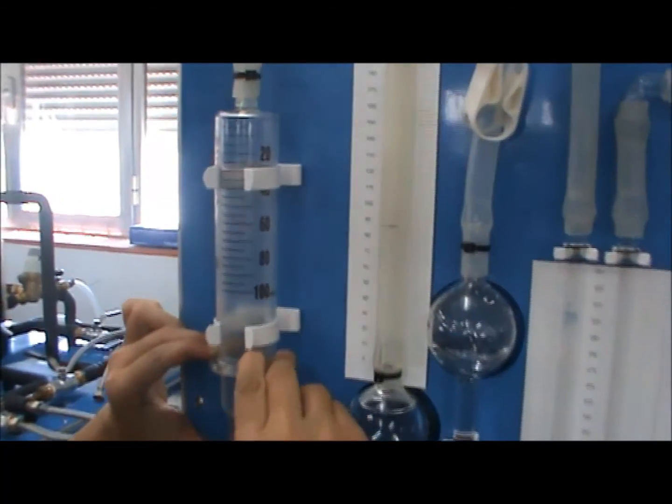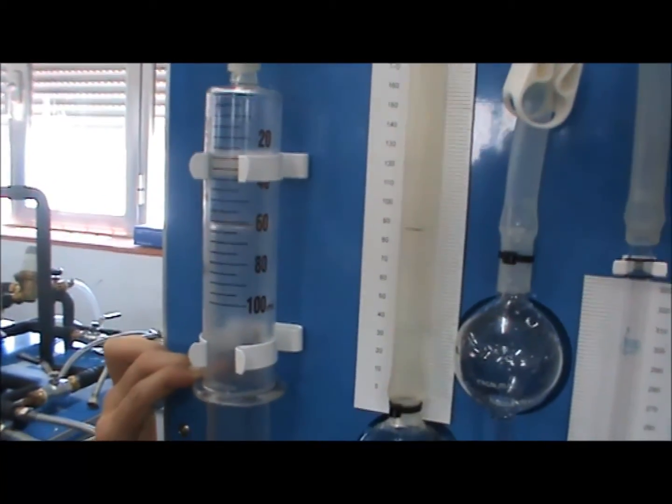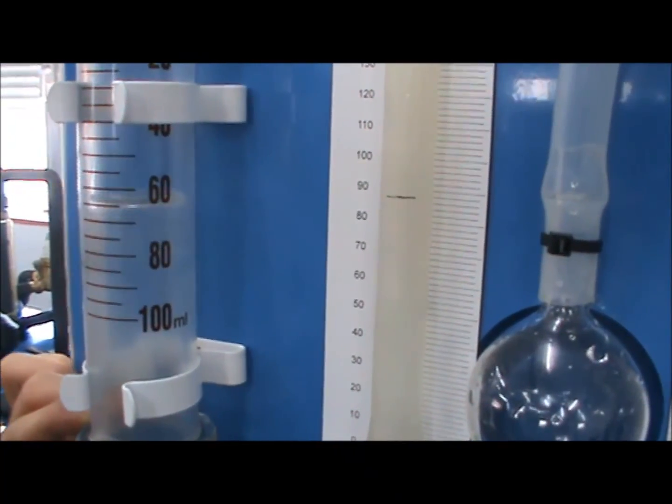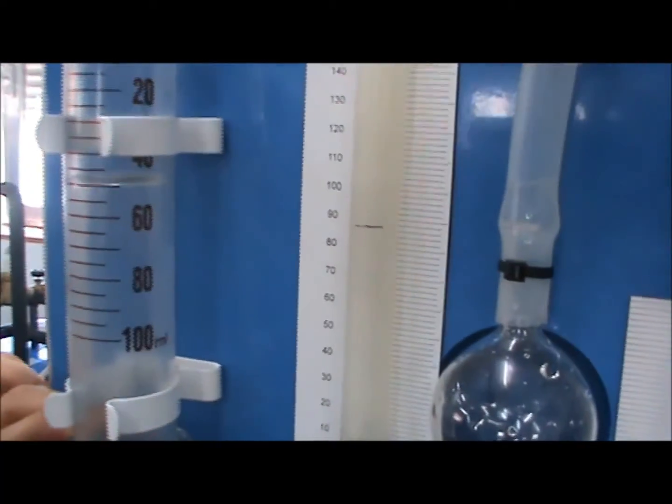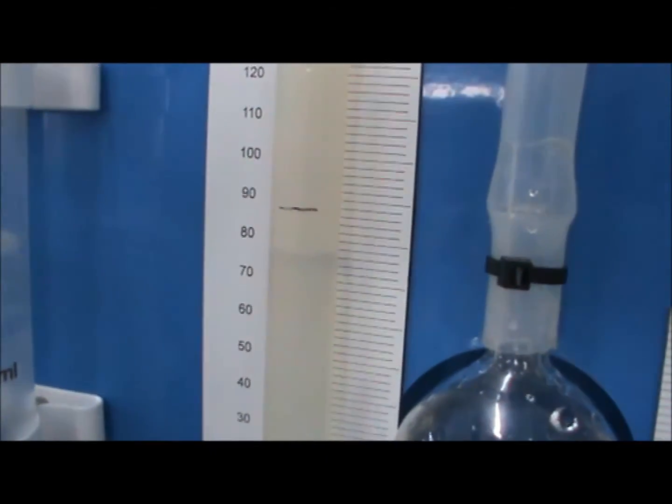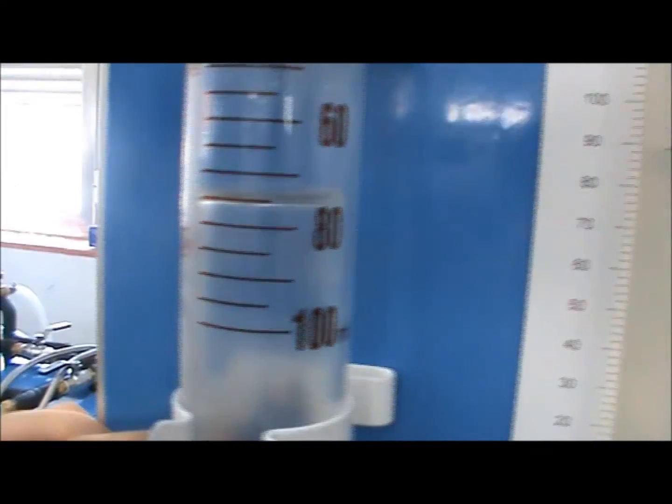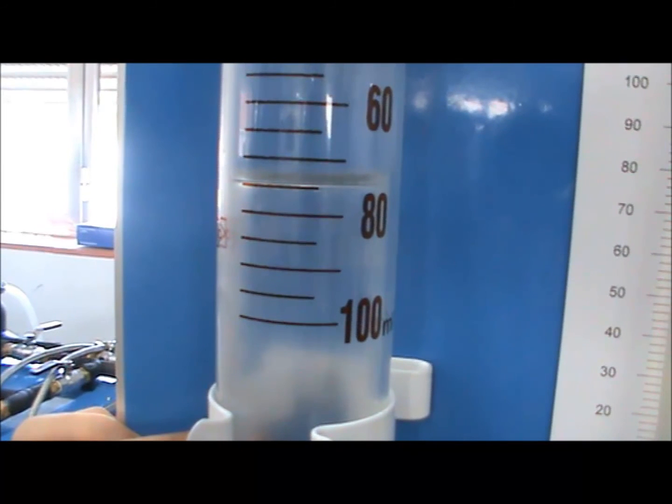Continue this process until you are able to easily compress the plunger, and the volume reduction in the syringe is constant. Now the absorption by the KOH solution is complete. Pull the plunger down to bring the solution to the marked level, and carefully measure the value shown on the syringe. In this experiment, the KOH solution absorbed 25 mL of CO2.